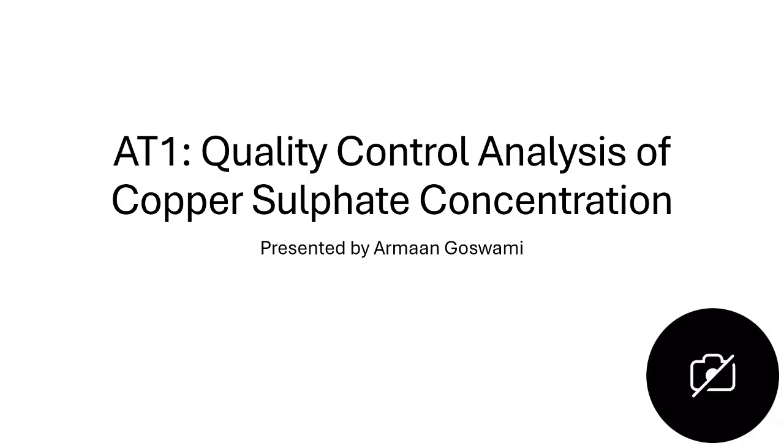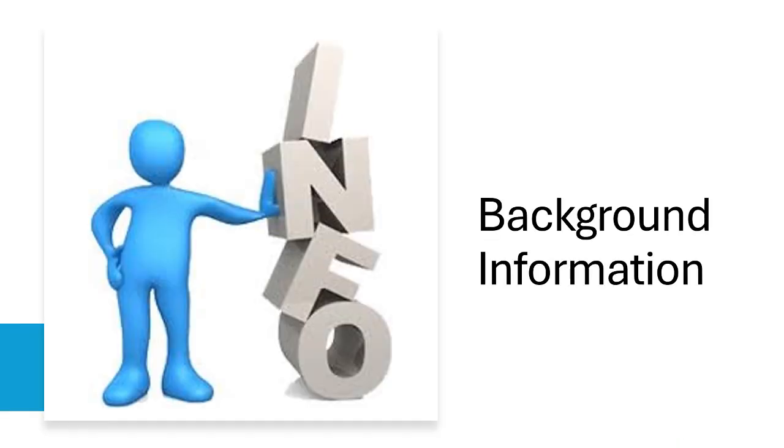This is the quality control video report for the WWC industrial chemicals, where I'll be determining whether an unknown copper sulfate solution meets the industrial specification of 0.6 plus minus 0.10 moles per liter. To actualize this investigation, I'll first outline the key theoretical concepts underpinning analytical chemistry.